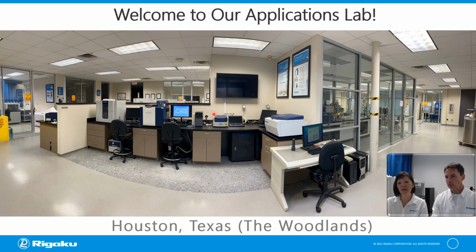But before we get into the actual workshop, we're going to spend about 30 minutes or so going over the theory, and then after that we'll go into the prep lab to show you some representative ways of how we do some sample prep, and then actually apply that to the methods and put it on the system to show you routine sample analysis. I'm Glenn Williams, by the way.